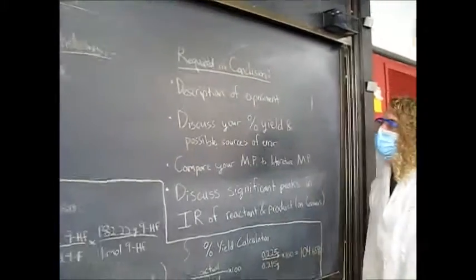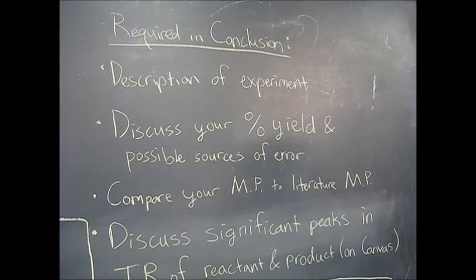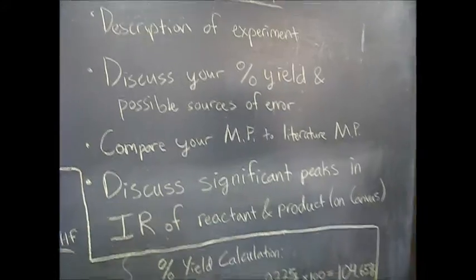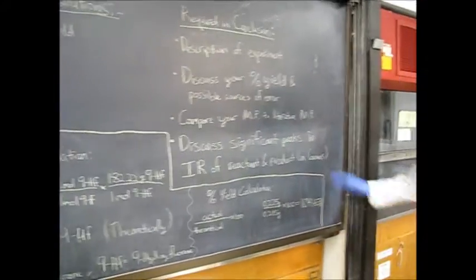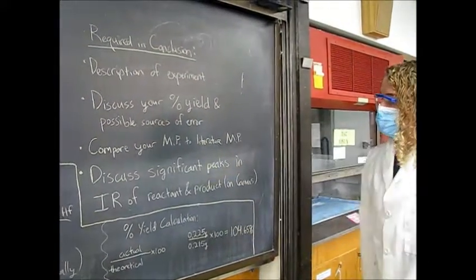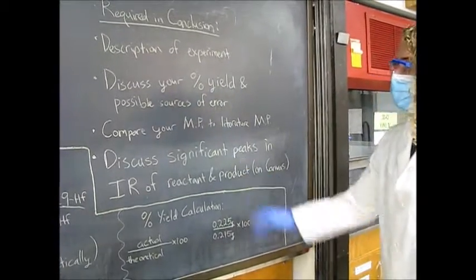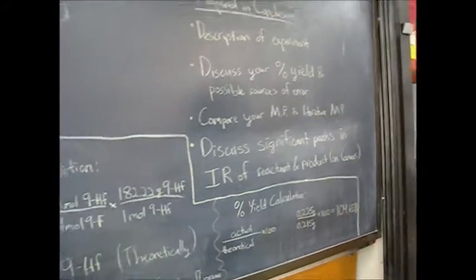Lastly, for the conclusion, we just need a good description of the experiment in general. Talk about the percent yield that you calculate and sources of error, like I just mentioned, and then compare the melting point that we give you to the literature melting point value. We're also going to give you IR spectra of both the reactant and the product. Those will be on Canvas. We'll just need you to talk about the differences between them and all the significant peaks in the spectra.